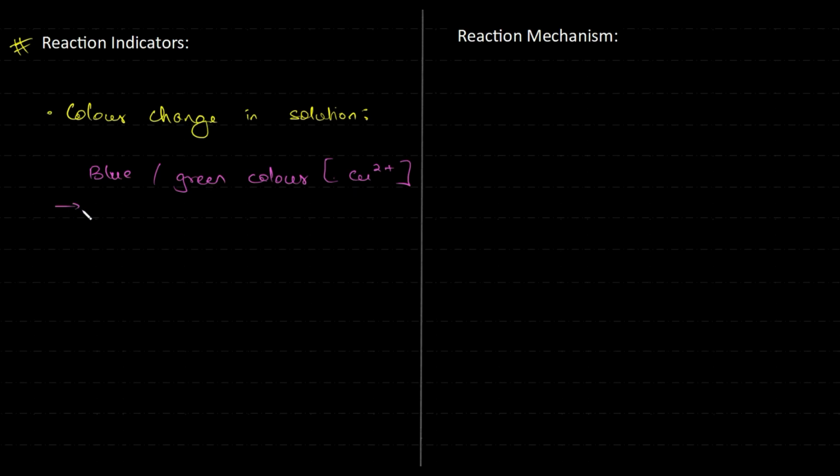This will fade out as lead chloride forms a colorless solution. So this is colorless, right? Again, when you see it practically, it will be easy to remember.